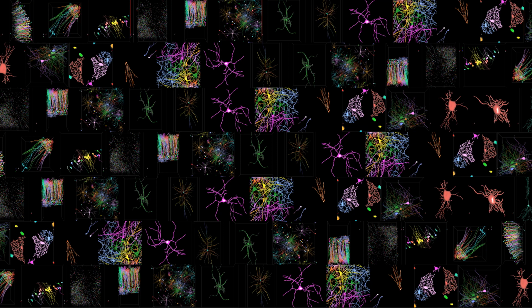Then if you go one level up, you can start to create some insights related to relationships between neurons, populations of neurons, and neurons in different regions, how they behave, how they function, and also how they are affected by disease and how they may recover with certain treatments. And that's true insight. To get there, we need to analyze hundreds, sometimes many thousands of images, like the ones in the previous screen, in order to get to true insight.